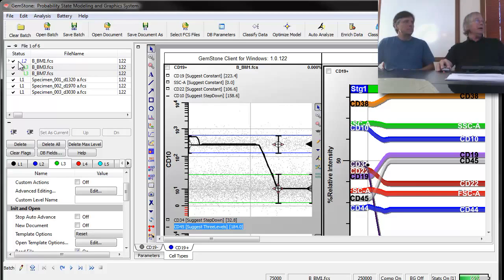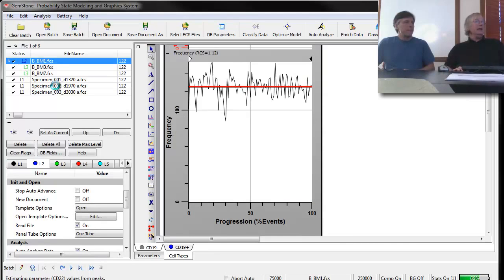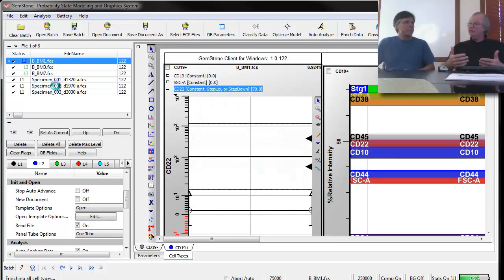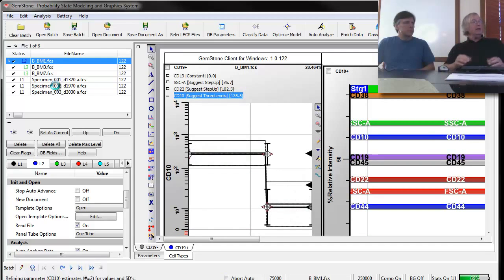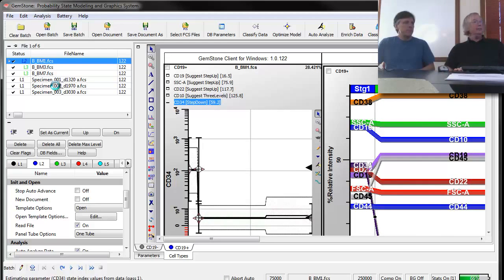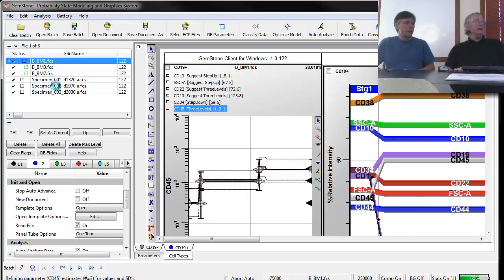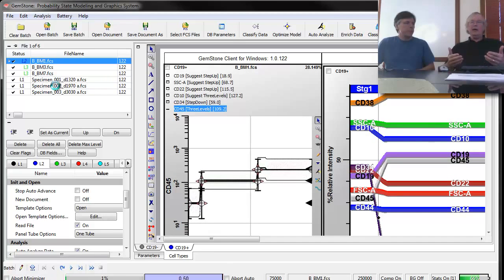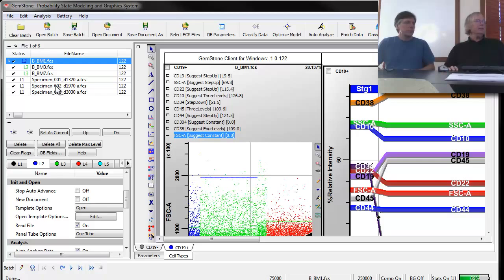So we're going to go ahead and double click on the first file. And so again, it goes through the selection process, goes through the stratification, but now you can see that it's exactly finding that transition point. Also seems to be moving through this a little bit quicker. Yeah, because we actually simplified the model, so there's less for it to do. And simpler sometimes is indeed better. So it's all done. Okay.